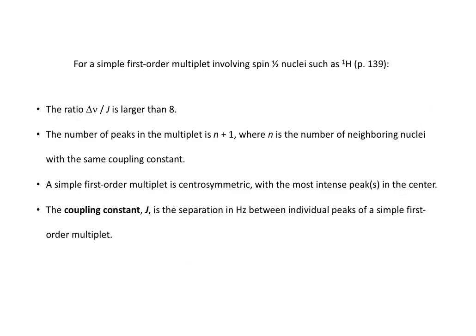The following definitions are required for a simple first-order multiplet that is easily analyzed, including a ratio for the difference in frequency over the coupling constant, number of peaks in the multiplet equal to n plus 1, and a centrosymmetric multiplet.